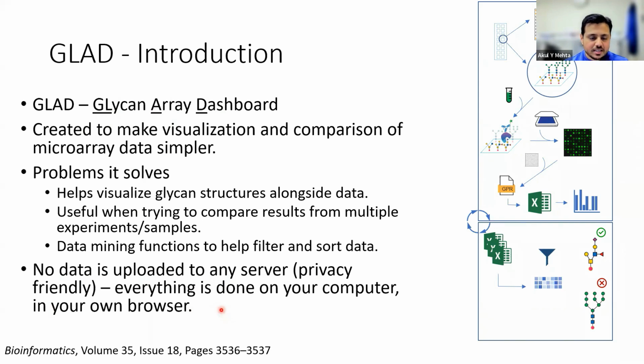But it also means that there is no saving on any server of the status of the application. So think of it like Word. At regular intervals, if you're using this application, I recommend that you use the save features in the software to kind of save your state of analysis at various time points, just so that, if things crash or anything happens, you don't start all over again.